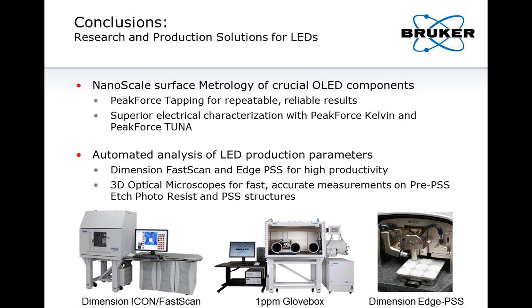So we conclude our webinar here. We have shown you that nanoscale surface metrology of crucial OLED components is possible with AFM, and AFMs are great tools in order to perform these tasks. We have shown that PeakForce tapping can be used for repeatable, reliable results, and that electrical characterizations with PeakForce Kelvin or Tuna measurements can be carried out and are indeed very useful to perform.